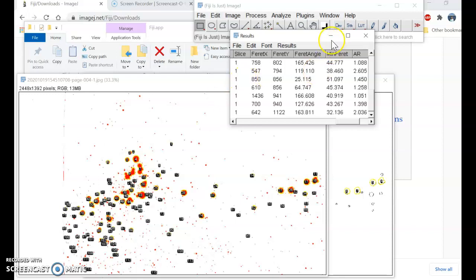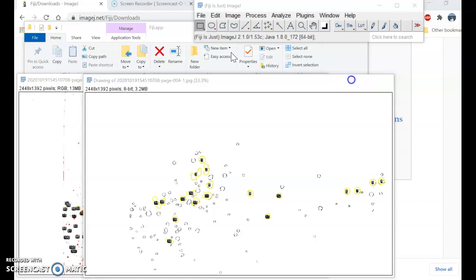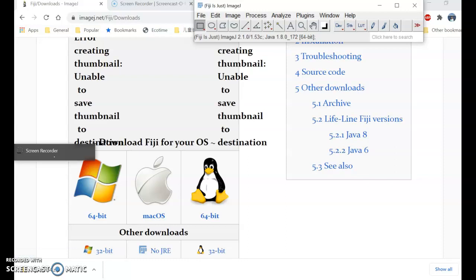I think I still need to open the manager to show what it's doing, but for some reason I cannot find it. Okay, I think I'll stop here. Let me know if you have additional questions, and I'll try to clarify myself better.